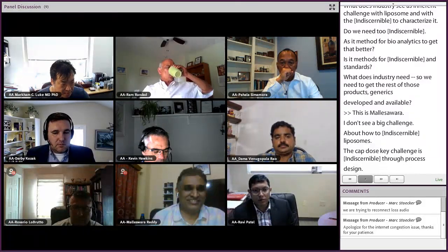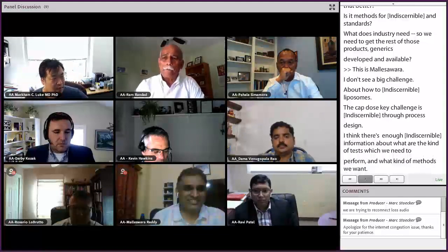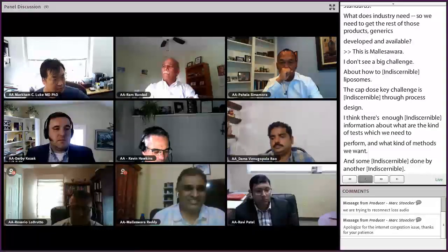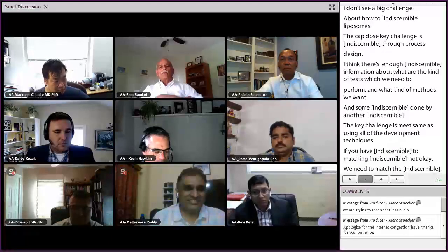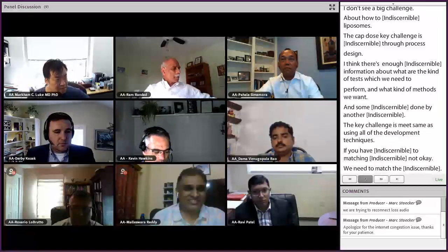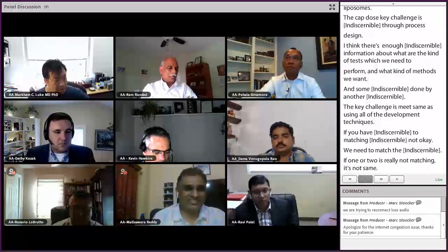But the key challenge is to really meet sameness using all the orthogonal techniques. If you are listing 15 different characteristics, matching 13 is not okay. You need to match 15. If one or two are not matching, sameness is not achieved. So how much does the process design make the product closer to the reference product? That's the key challenge. Of course, the bioanalytical challenge definitely exists, which I'm not an expert on, but characterization is largely evolved for liposomes.